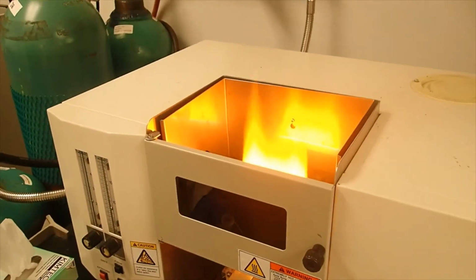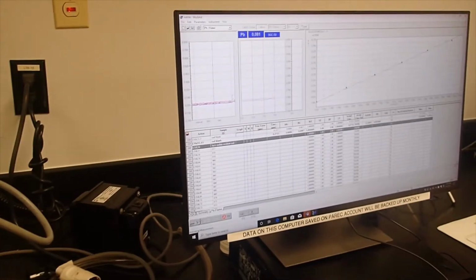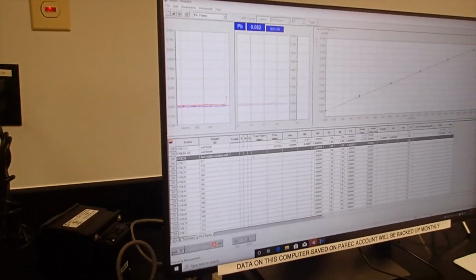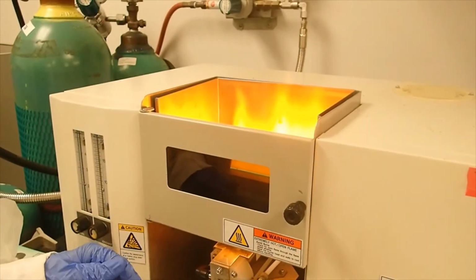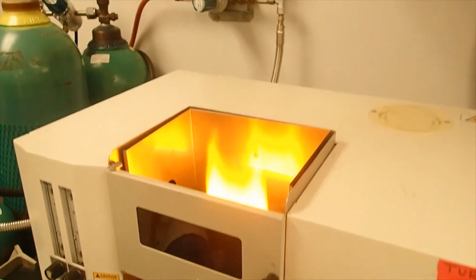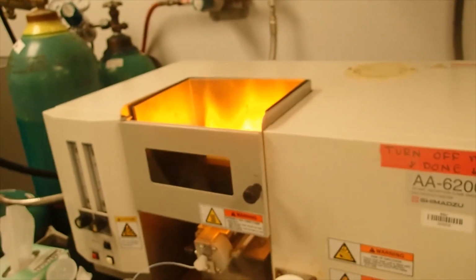It's definitely a little bit darker. And there's definitely lead in this soil. Look, we jumped up. Concentration of lead. Oh, you can see it. Wow.